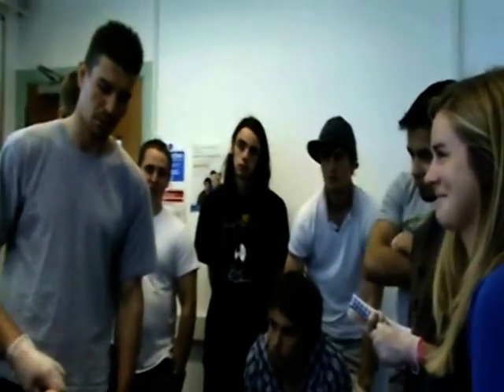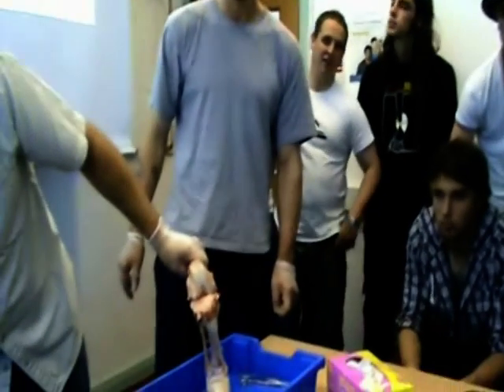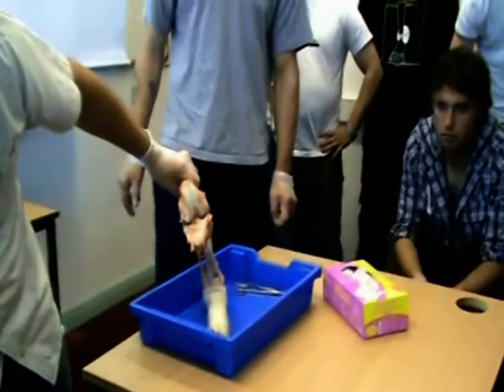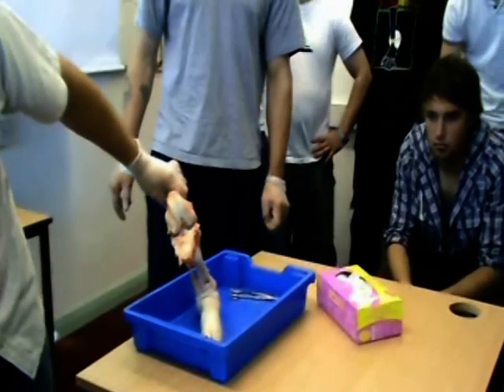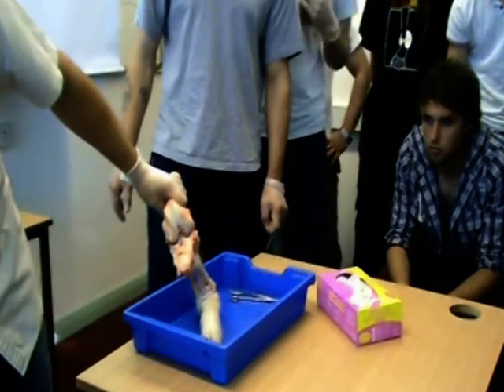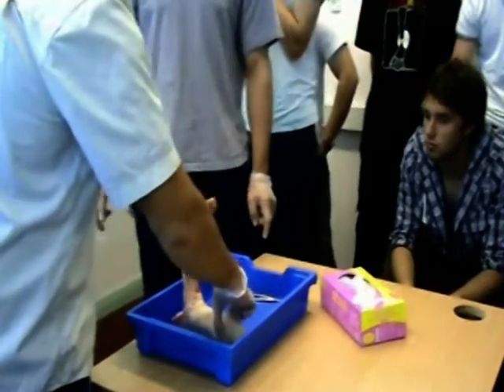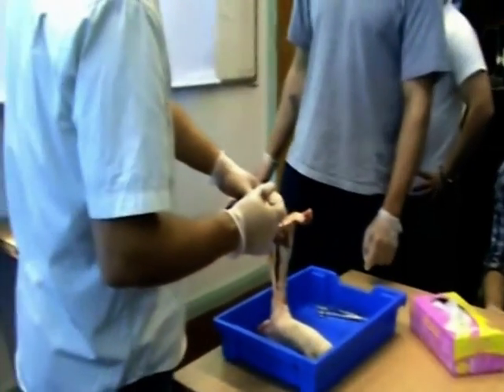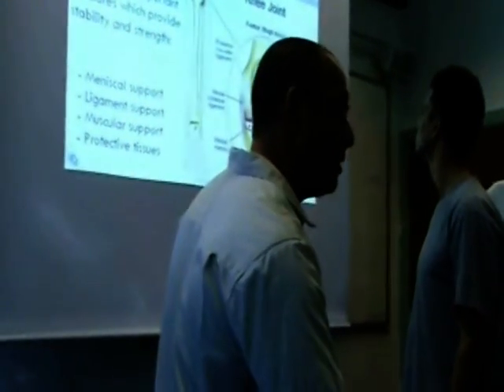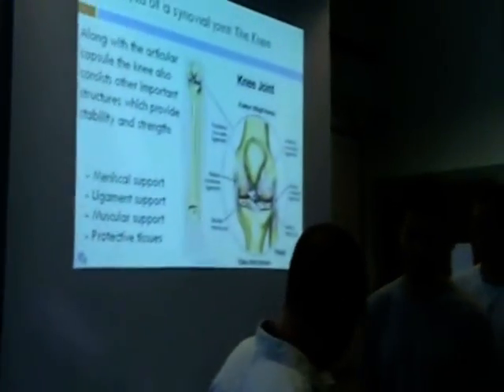Okay, if you've got clean hands, go back one slide. Right click previous, please. Okay, we look on the board, guys. Lateral collateral, medial collateral. Which one will be this side here? Which one did I just cut? Medial. Okay. The lateral.